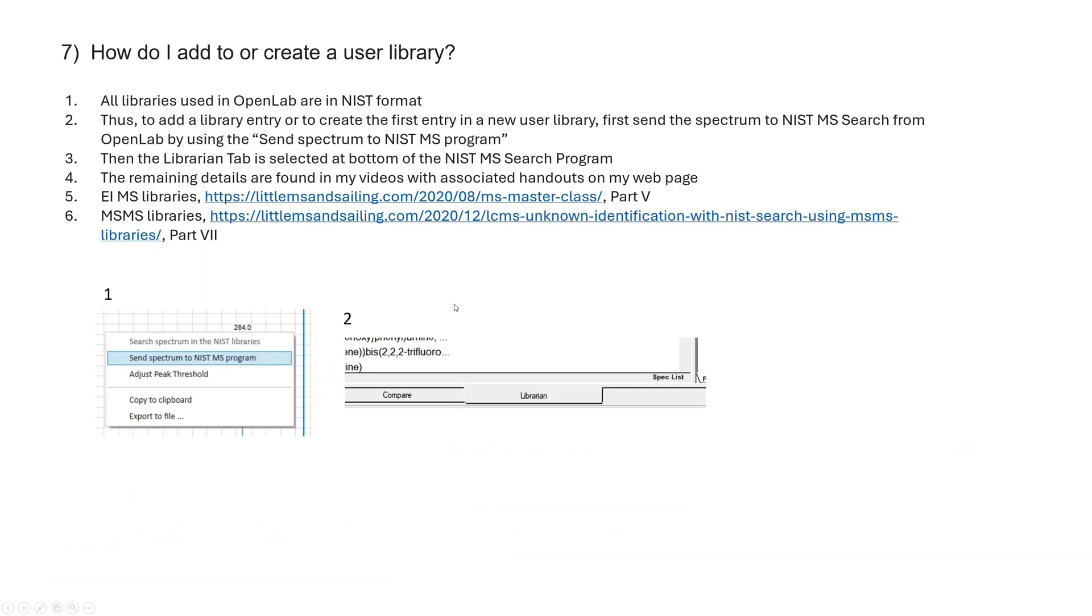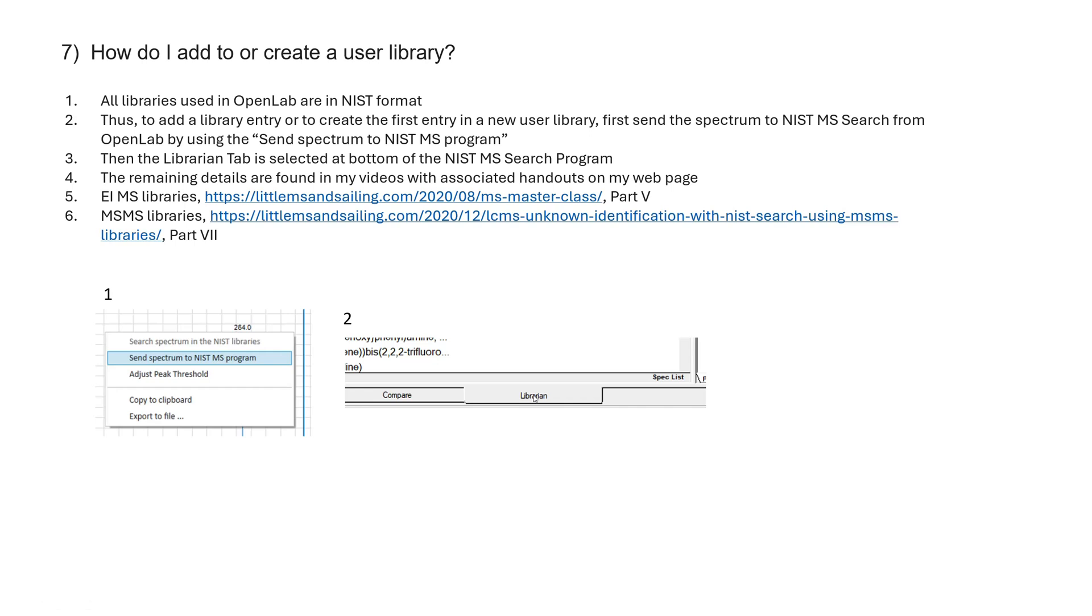How do I add to or create a user library? Again, all libraries used in OpenLab are in NIST format. Thus, to add an entry, you first have to get it open within OpenLab, and then you send it to the NIST search. And then you can go into the bottom where it says the Librarian tab here at the bottom. And that allows you to add comments, put structures with it, whatever, molecular weight, molecular formula.